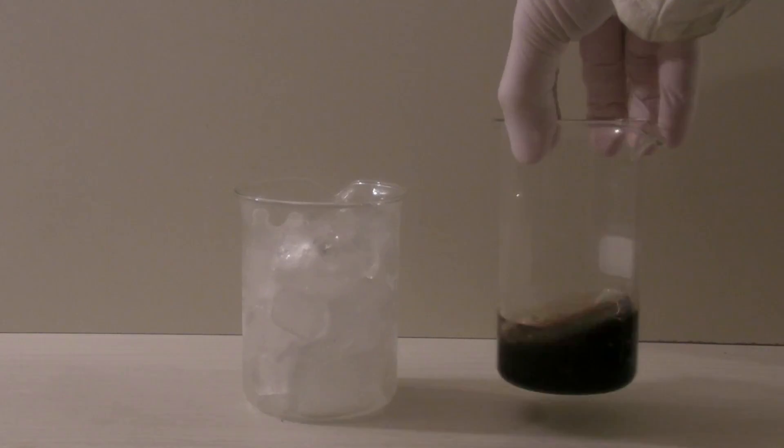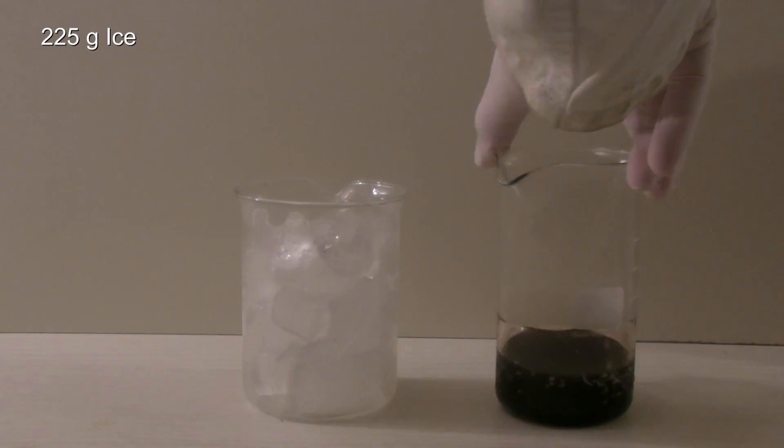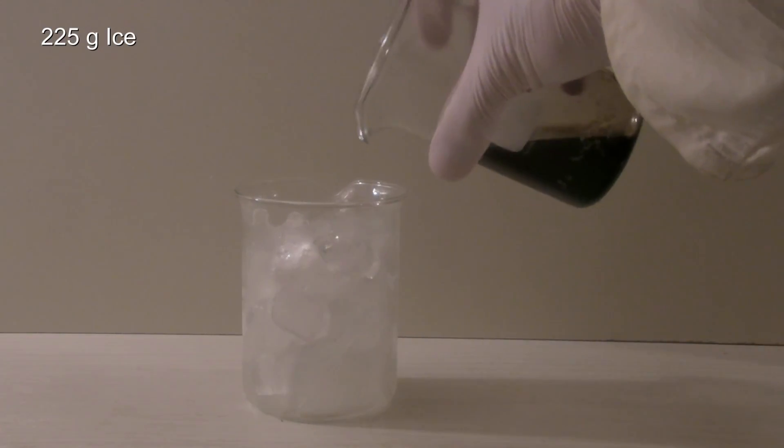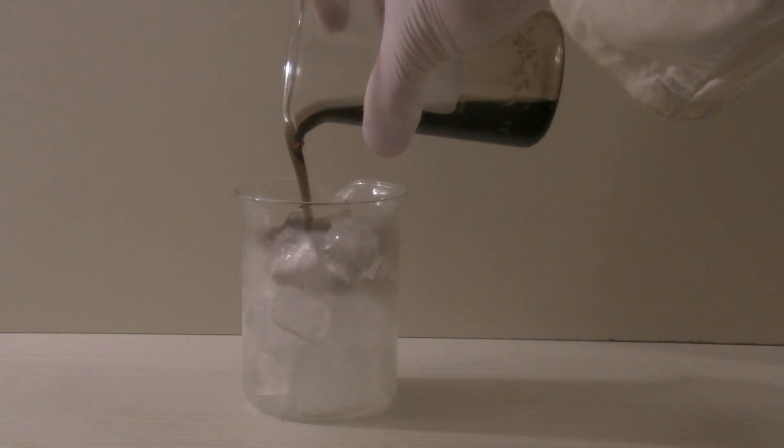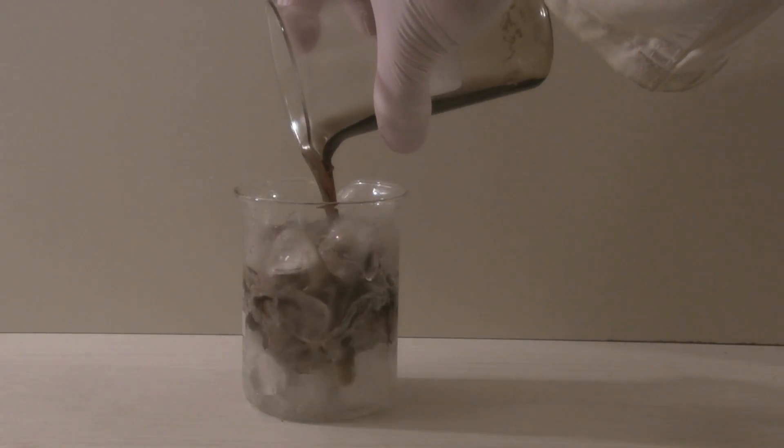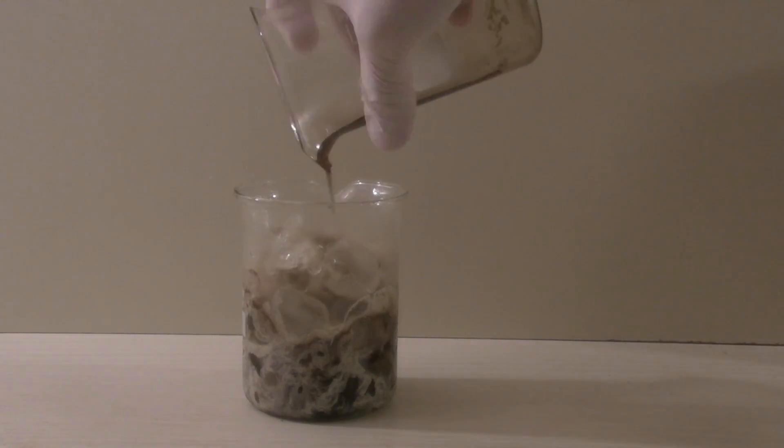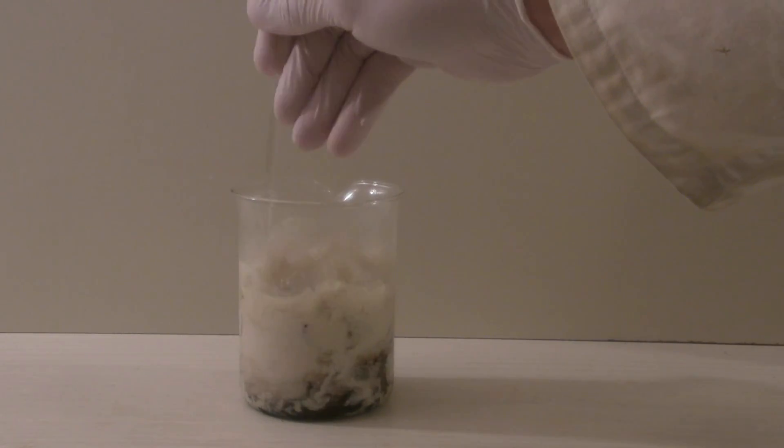When the mixture has reached room temperature it is added to a beaker with 225 grams of ice. This causes all of the dissolved compounds to precipitate and prevents it from heating up due to the mixing of the acid with water. I used ice cubes but crushed ice would be more suitable as it would melt faster. It is then mixed and left to sit until the ice has molten.